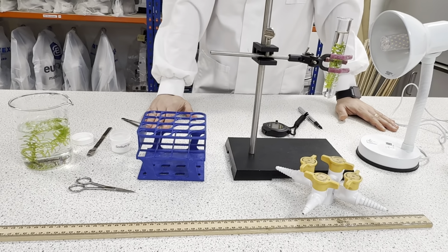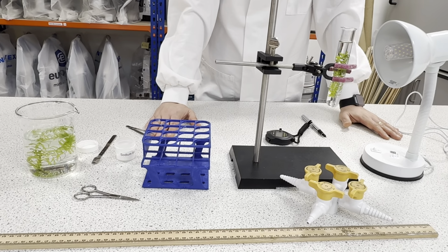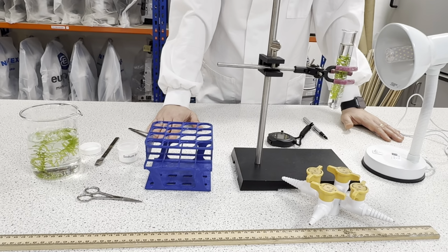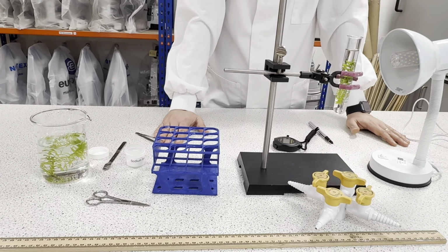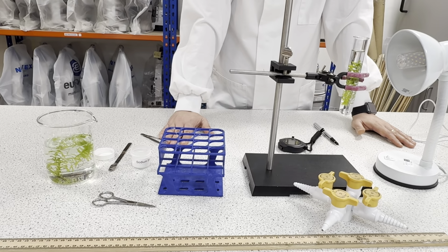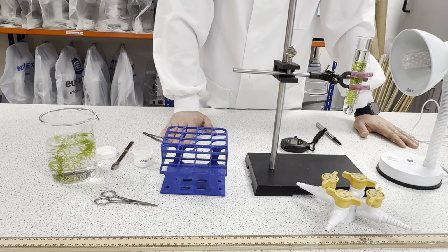Some methods say to keep counting the bubbles for 30 seconds. Other methods say to keep counting for 1 minute. So depending on the method you're following, you have different approaches. Although after you do whatever the method says, so let's assume 30 seconds for example, then you're going to increase the distance.